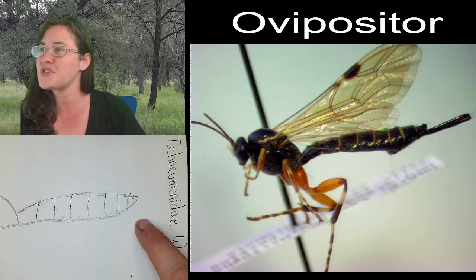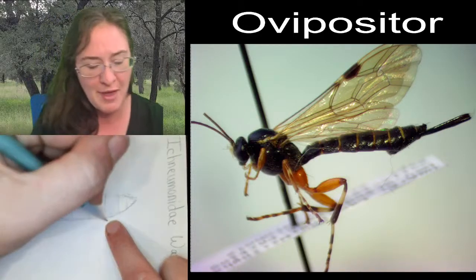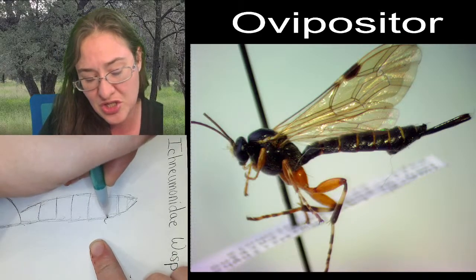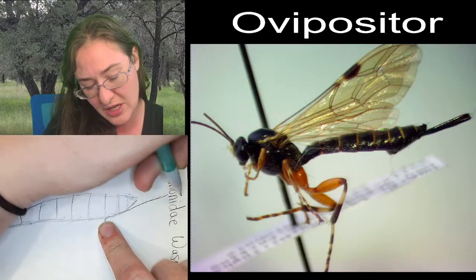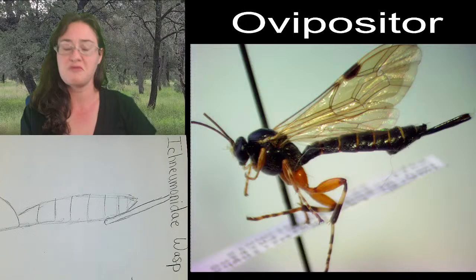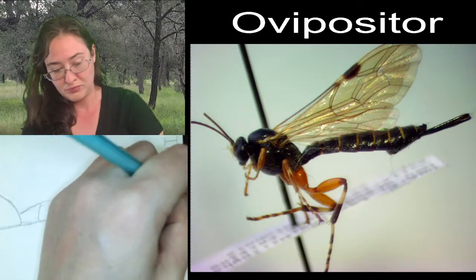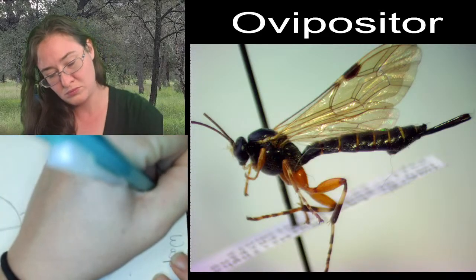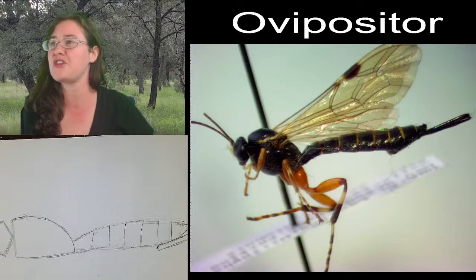Now, it almost looks like the ovipositor comes all the way back to maybe the third abdominal segment and changes the shape of the abdomen from here. So I'm just going to go ahead and give us some shape that looks like that. There we go. And then we're going to get these wings in.